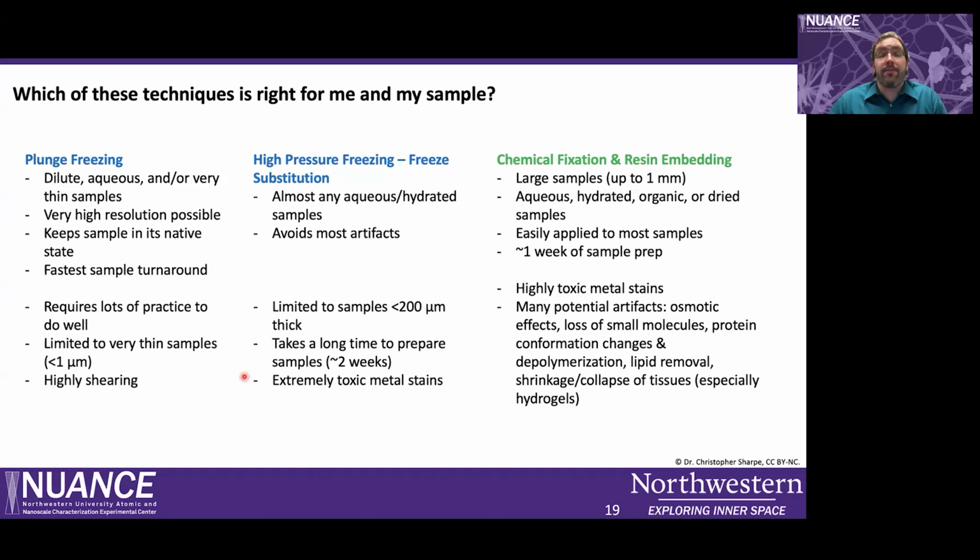It does have the advantage of the highest resolution possible of any of these three techniques, and it keeps your sample in its native state the entire time, so you have usually the lowest chance of introducing any artifacts. Finally, it has the advantage of having the very fastest sample turnaround of any of these three techniques. Your typical plunge freezing cryo TM session is going to be on the order of 1 to 2 days for all told sample prep and imaging, whereas for high pressure freezing, freeze substitution, chemical fixation, you're looking at more like weeks.